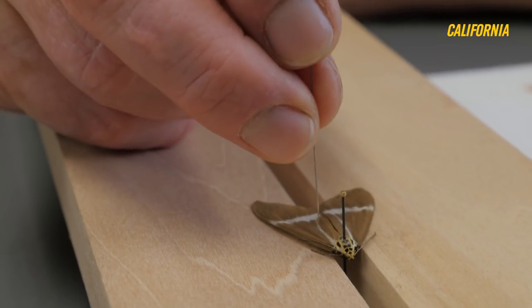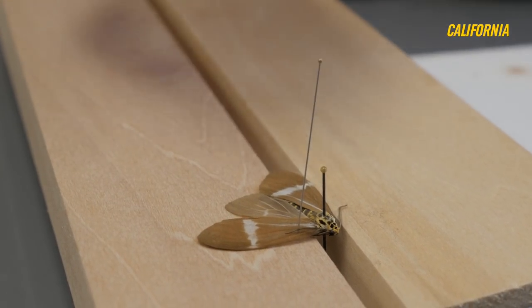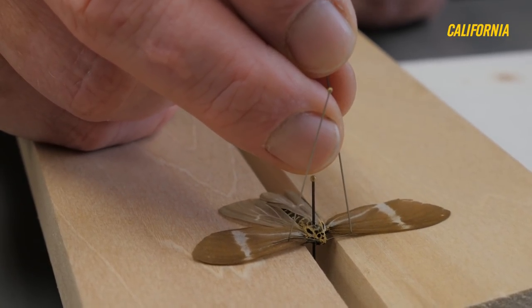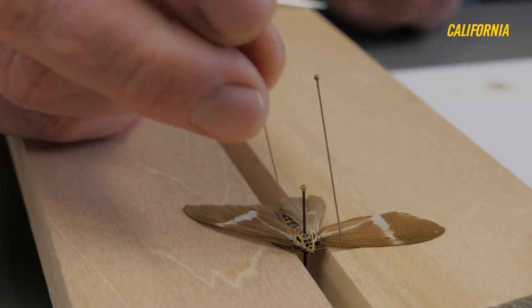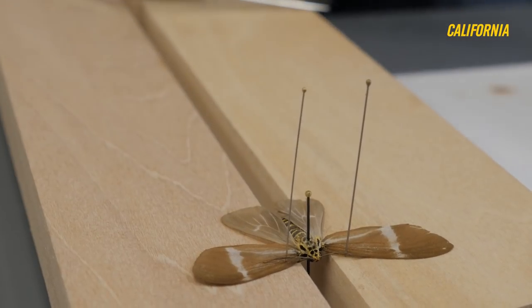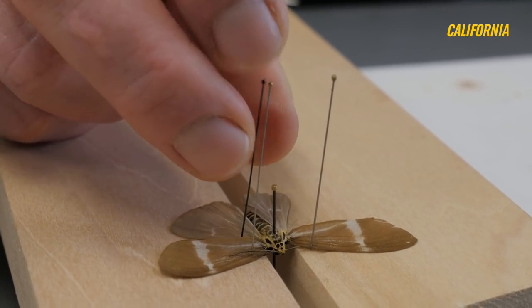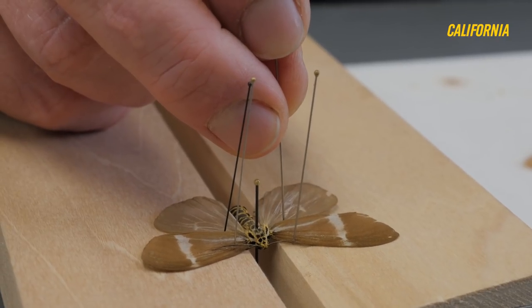I'll use another pin to tease the wings out. The position we've more or less agreed on for the wings is not a natural position at all — they don't fly with their wings quite this far forward, and certainly they don't rest on trees with their wings in this position. Nice. Hopefully my next one will be smoother.